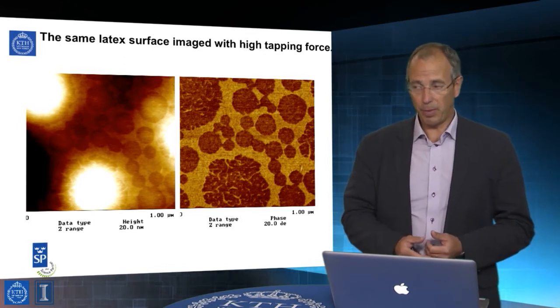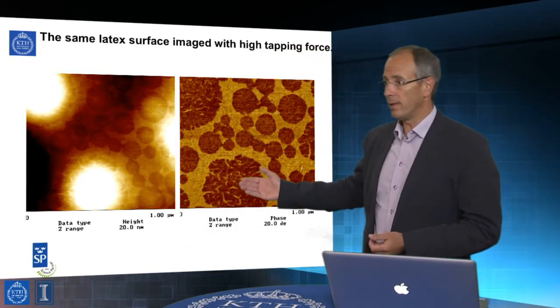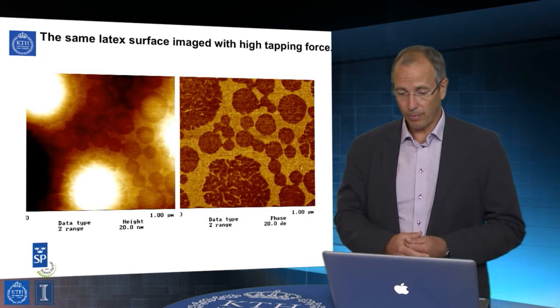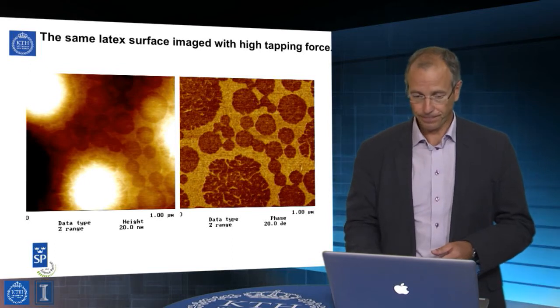And you can see these big topographic blobs here, which are showing up as white images. They correlate to this softer material here, the brown polymer in the image. So we can get a very, very good feel for how the different components are distributed in the polymer matrix.